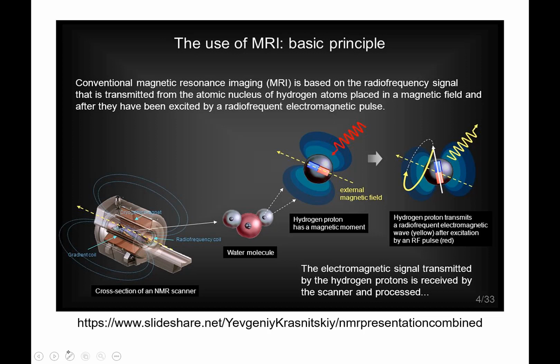There's a radio frequency coil that you sit inside of. So basically, our sample would be a tube that's sitting in like this. You're horizontal if you're in the same system. Incredibly strong magnets.